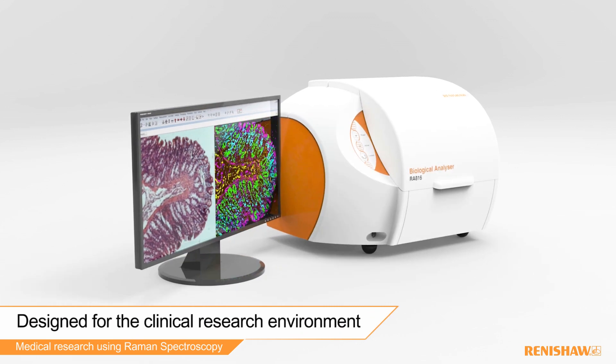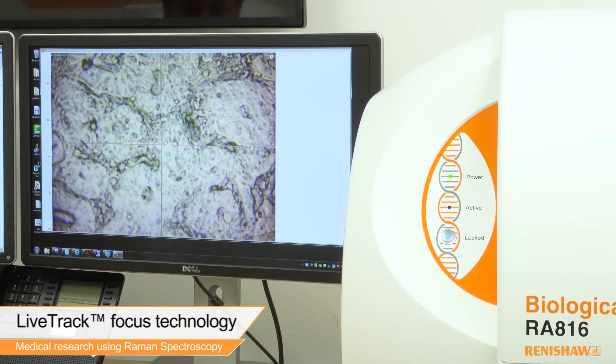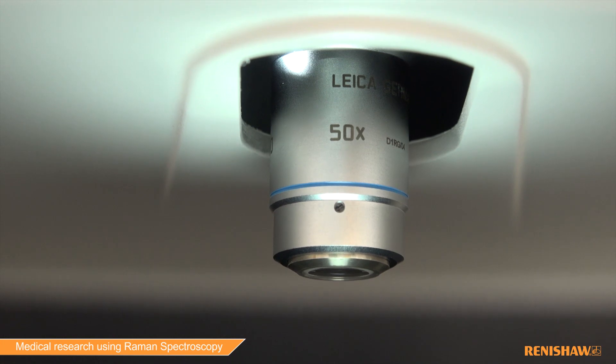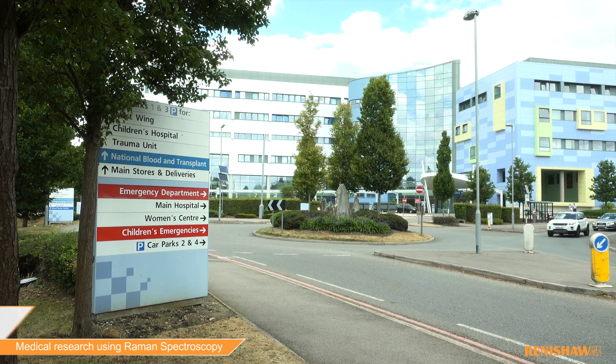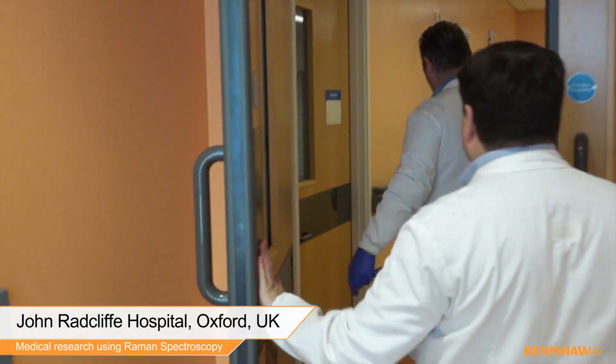The Renishor Biological Analyser has a range of features making it the ideal tool for clinical research. The system has optimised microscopic live track focusing technology and the ability to view samples at low and high magnification with minimal effort. It features dedicated software which enables the building and validation of disease models and supports the transferability of these models to other machines at other locations.